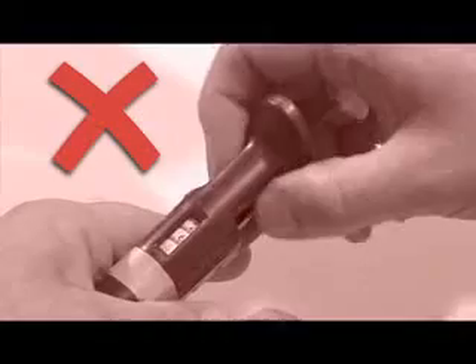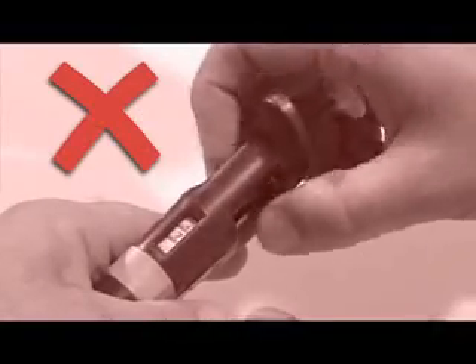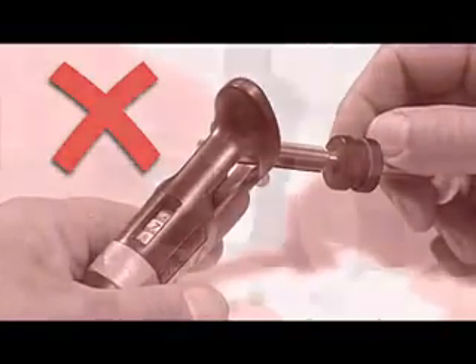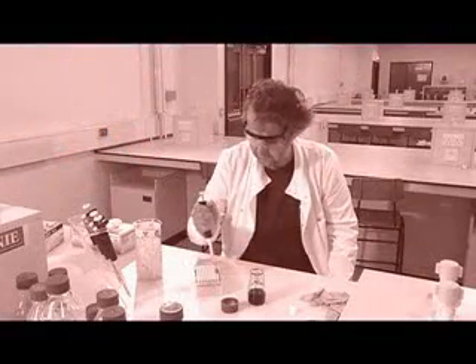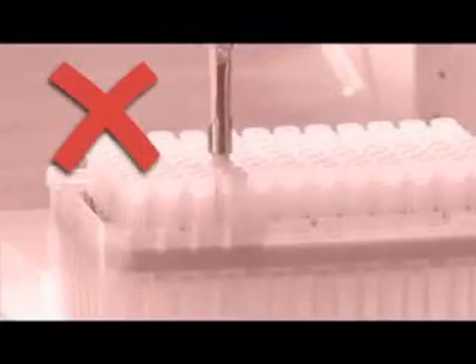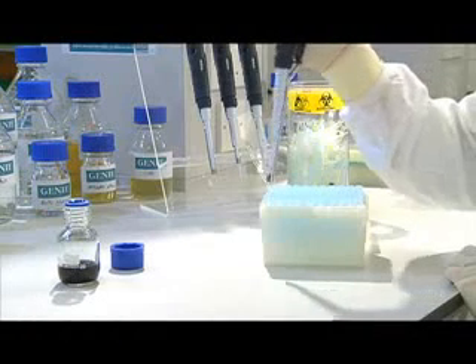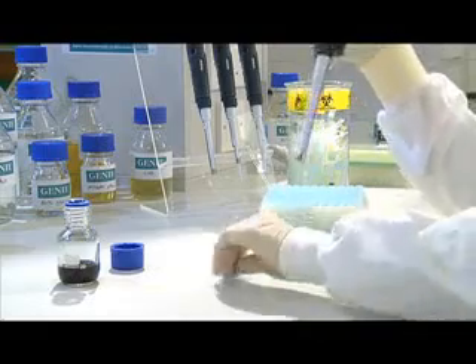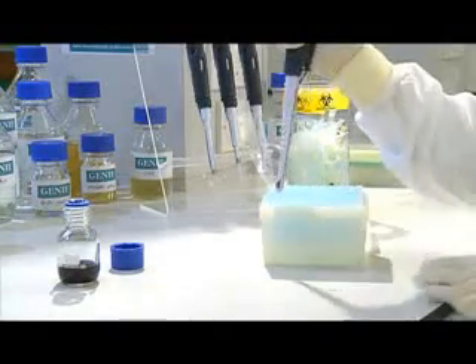Do not use a pipette past its volume limits. This causes pipetting inaccuracies and also damages the pipette. If you're having trouble attaching a tip to your pipette, don't repeatedly jam the pipette into a tip — this can damage the pipette. And if the tip doesn't stay on the end of the pipette, simply repeat the procedure with a new tip.